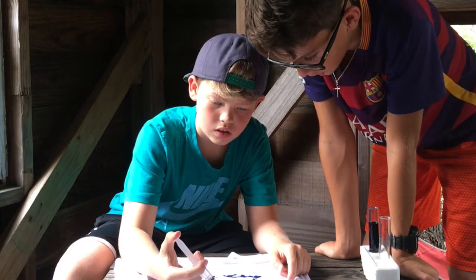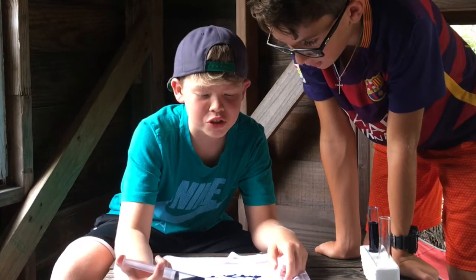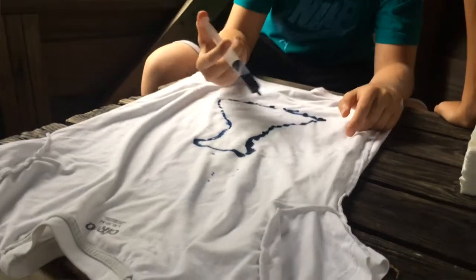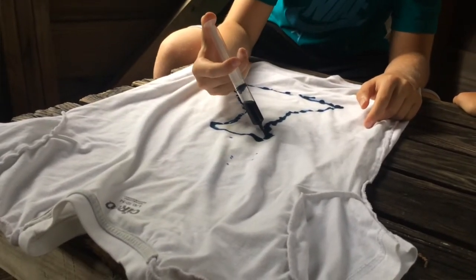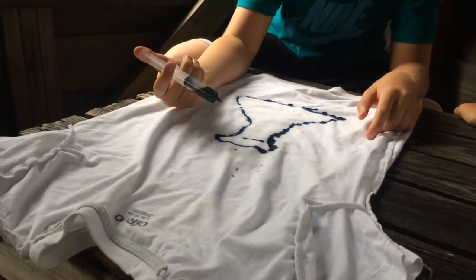Never use this on your hand or anything — just use it for your shirt if you want to dye something. Look, this is going to be our Backyard Science shirt right here! This stuff stains like magic.